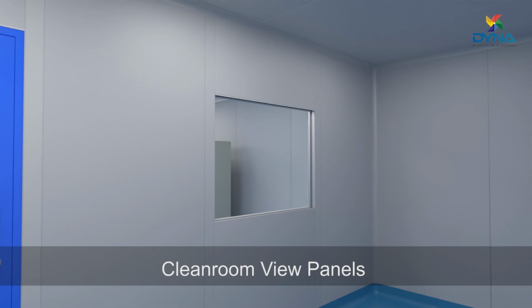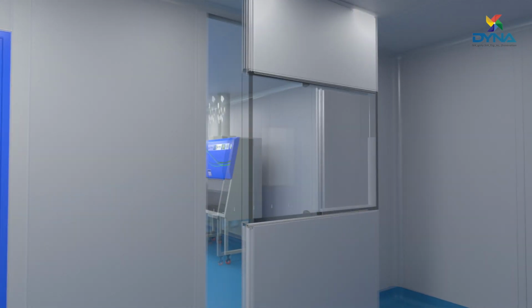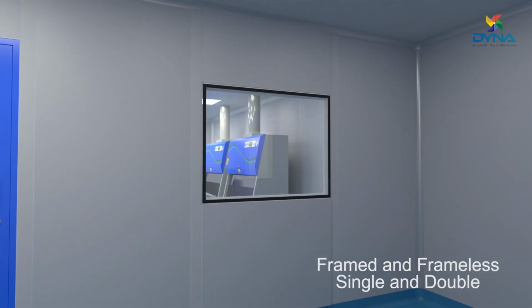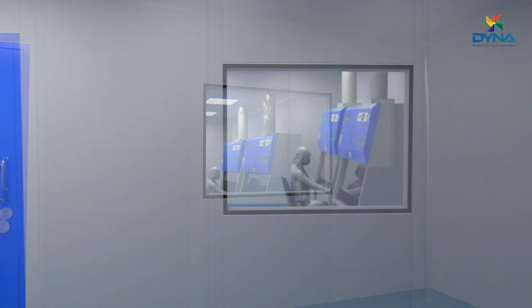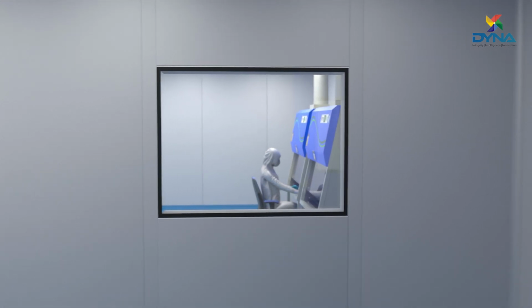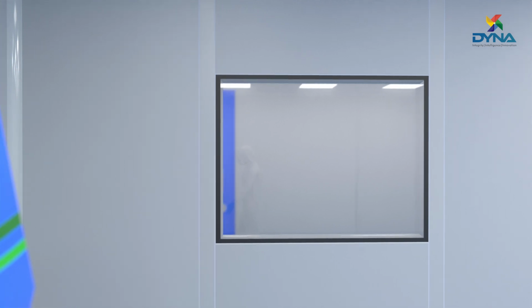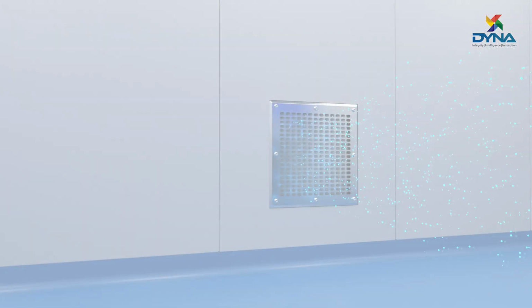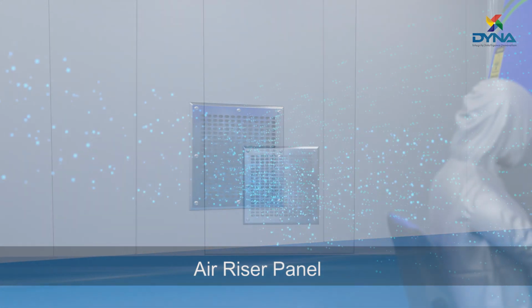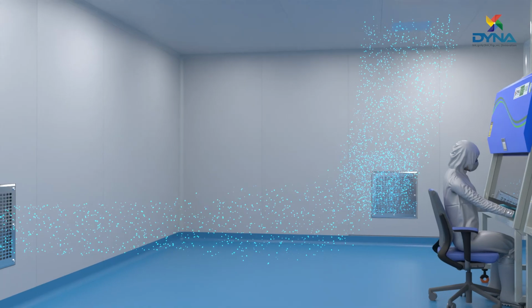Dyna's cleanroom view panels are provided in both framed and frameless designs with single and double-sided window construction. The view panels facilitate easy interaction and viewing between clean corridor and clean room, and also between clean rooms of same or different air class. Dyna's return air risers are used to collect the atmospheric air inside the clean room in a controlled manner so as to maintain laminar airflow.